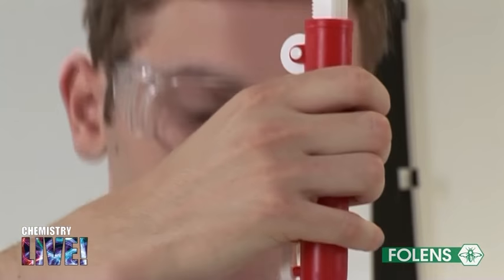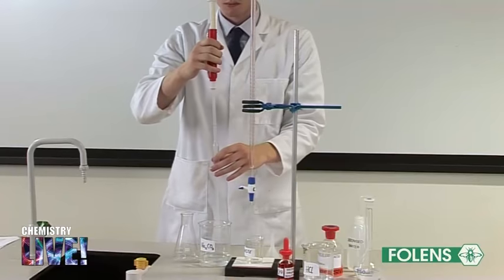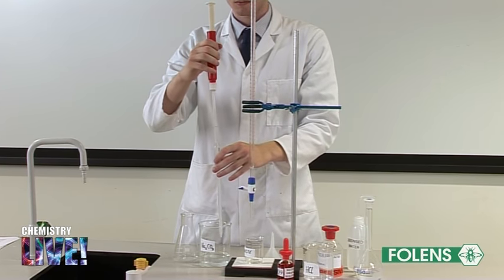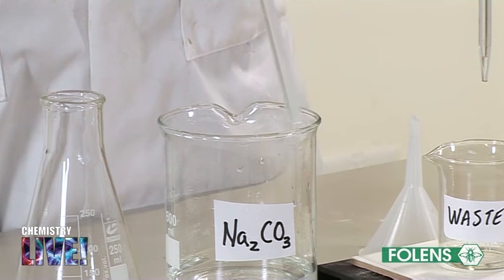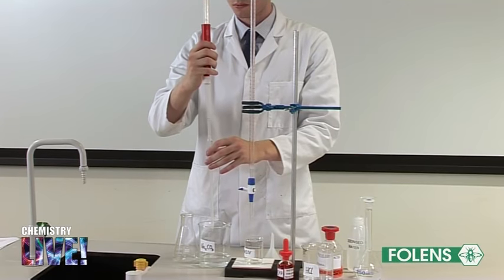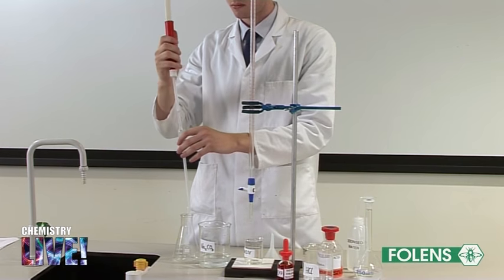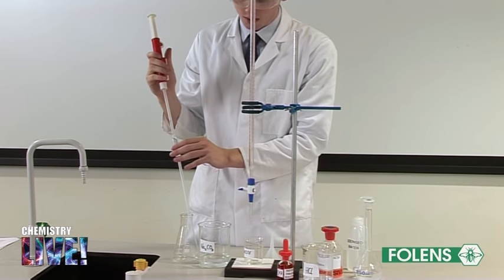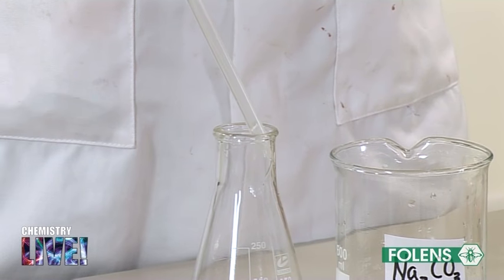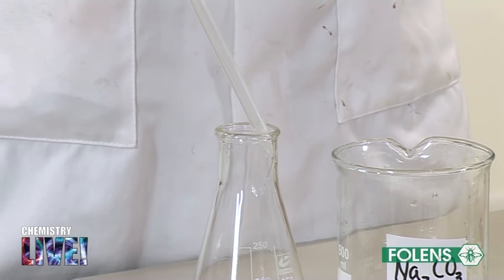When the bottom of the meniscus is level with the graduation mark, the tip of the pipette is touched against the side of a glass beaker to remove any drops adhering to the tip. The pipette is then allowed to discharge slowly into a conical flask, keeping the tip of the pipette in contact with the side of the flask. This avoids splashing of the liquid.